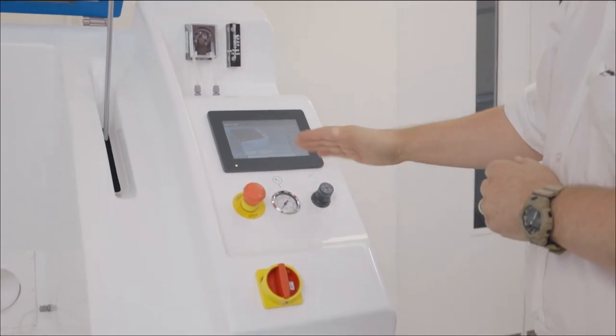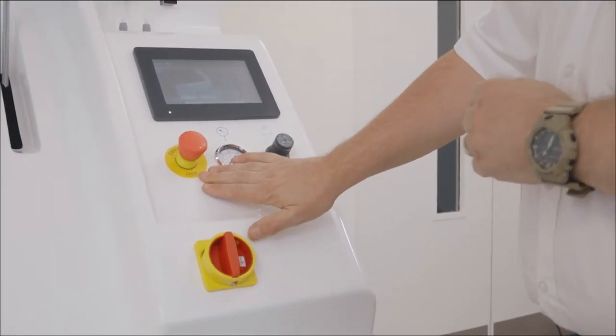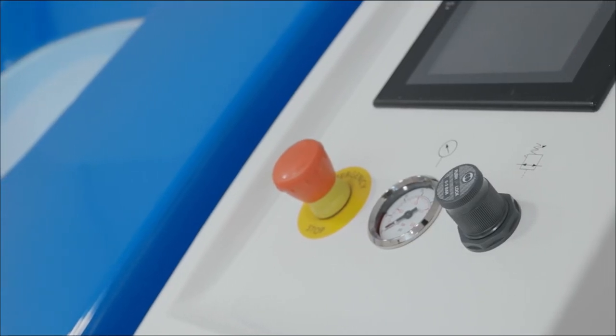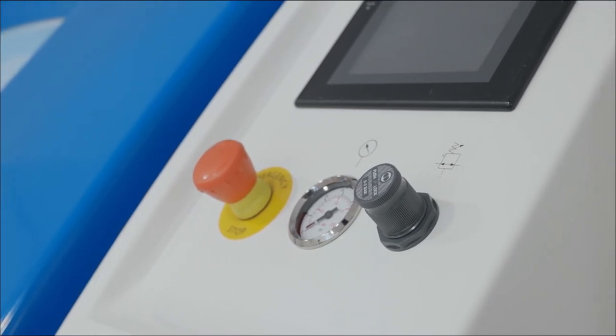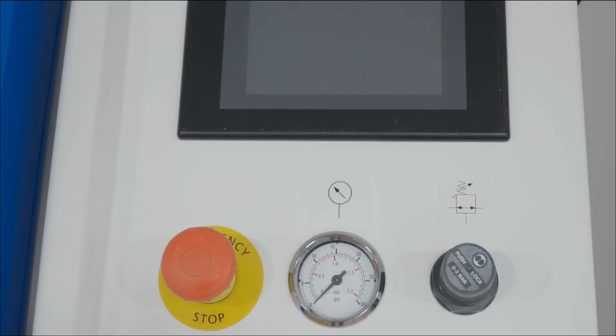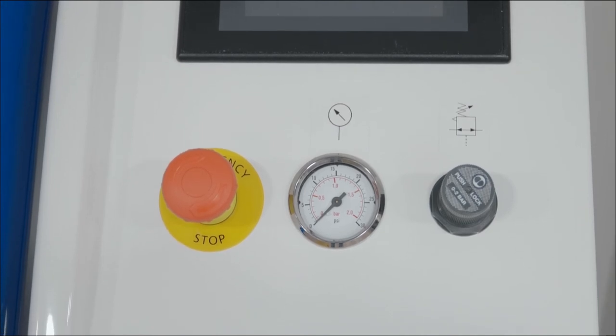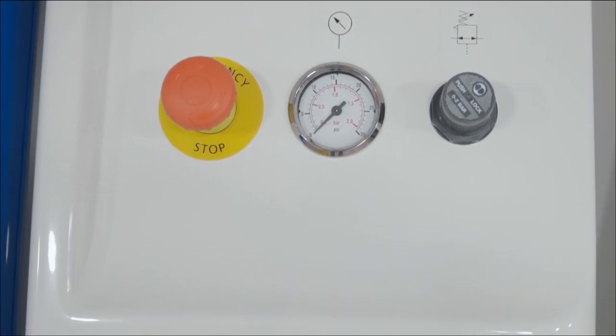Below the control system we have an emergency stop button. This will cease all programs, heating operation, canopy movement, etc. in the event of being pressed and will also set off an audible alarm.